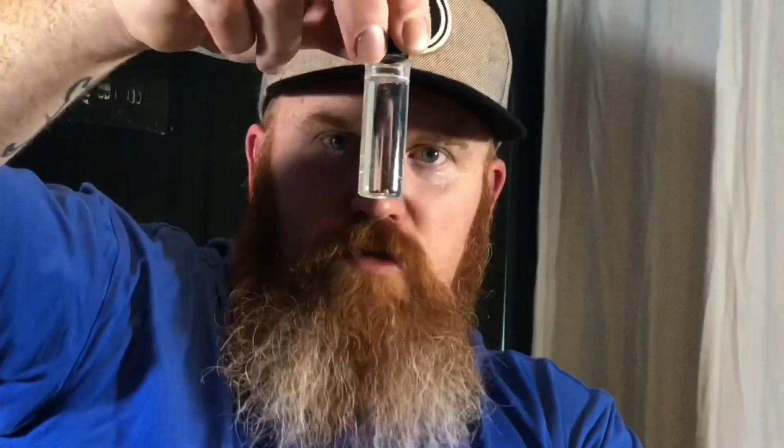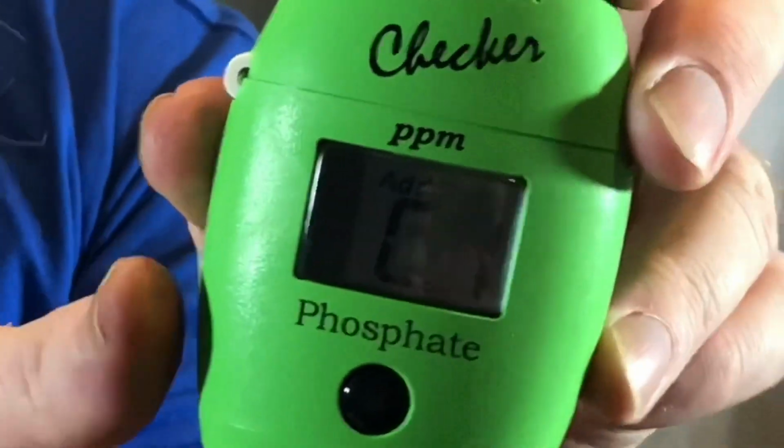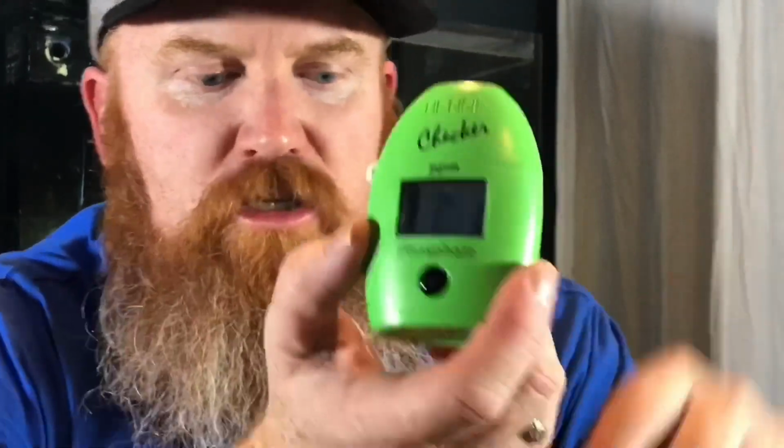Hanna Checkers don't like all those bubbles, so you do need to get rid of them, or most of them, before you actually put it in there. On the front of the Hanna Checker itself, the screen now says C1 on this particular one, which means I put in a vial of just salt water with no reagent in it to get a first reading. So you put that in, press on that. Takes about a minute or so for it to read. In the meantime, you get your reagent ready.